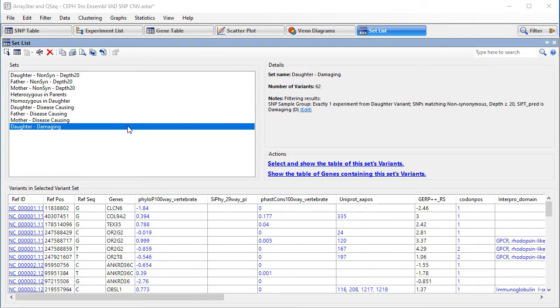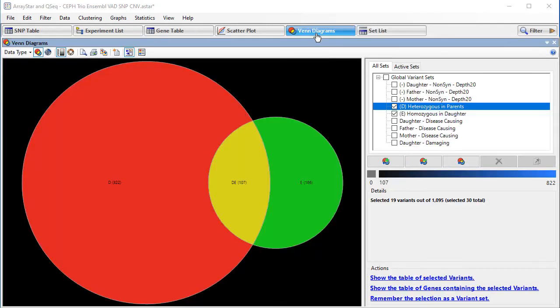You can then repeat these steps for as many sets as you like. In this case, I've already created numerous sets. You can then compare these sets using Venn diagrams.